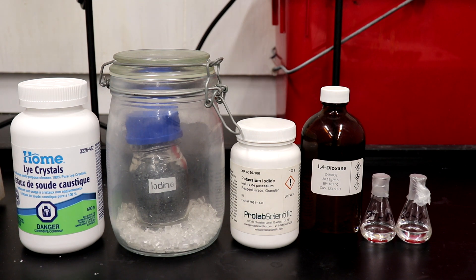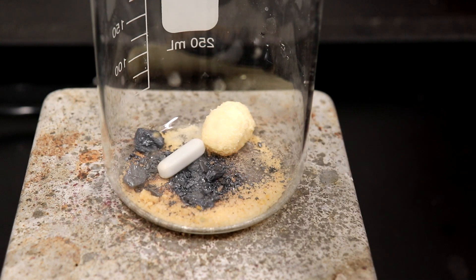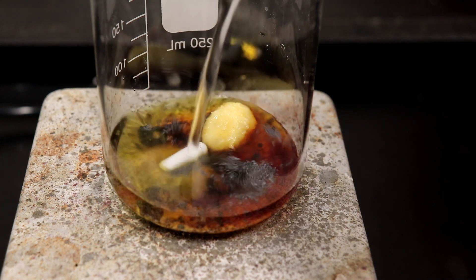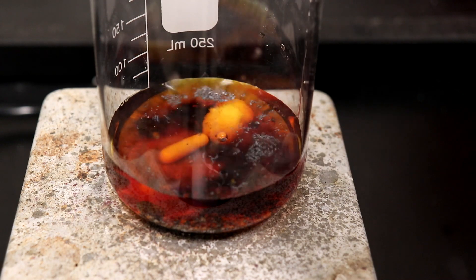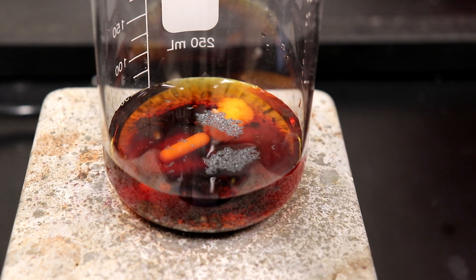In search of some more conclusive results, I decided to run the iodoform test for methyl ketones on both of the samples. I first had to prepare the testing reagent by dissolving 5 grams of iodine and 10 grams of potassium iodide in 50 ml of water.